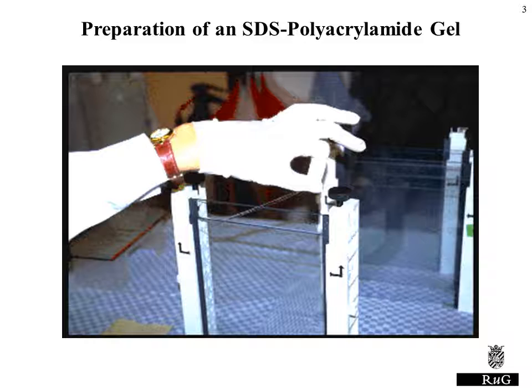You can also see that it takes some caution to run SDS polyacrylamide gels. Especially, you should not touch materials with your hands, because your hands contain proteins on the surface, especially keratins. If you touch the gel or samples or pipette tips with your hands, there's a high chance that you will contaminate your sample with keratins, and later, when you want to identify the proteins, it will be difficult because most of your hits will be due to the contaminating keratins.